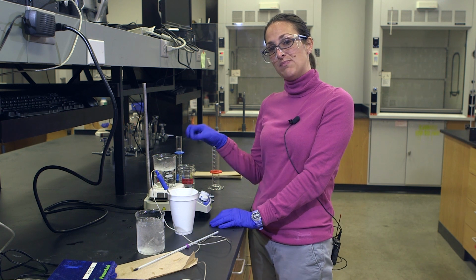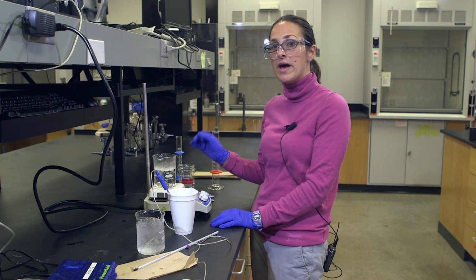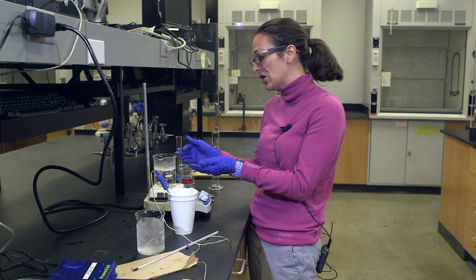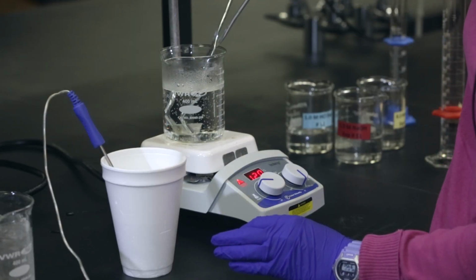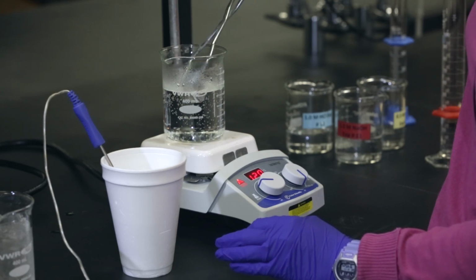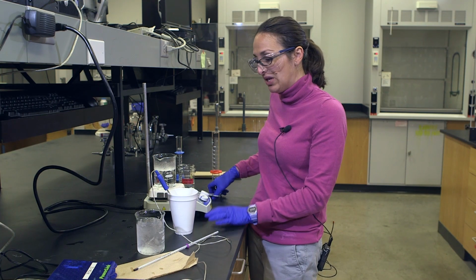I need to leave this piece of metal in my hot water bath for a couple of minutes. It's going to take a little while to reach thermal equilibrium to transfer the heat from the water to this metal object. So after I've waited several minutes, I'm going to use my tongs. I'm not going to put my hand in there because it's hot. I'm going to use my tongs to pick it up, shake off the water, and immediately put it in my cup.